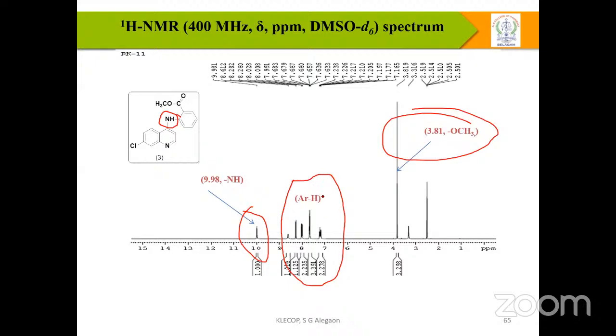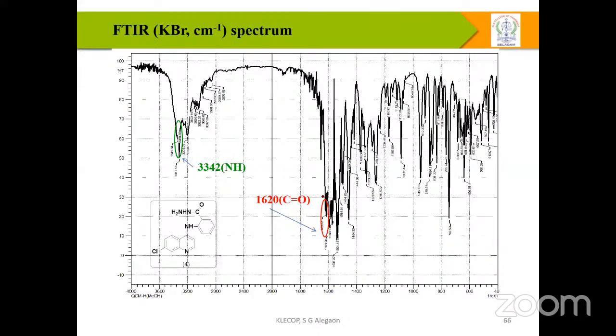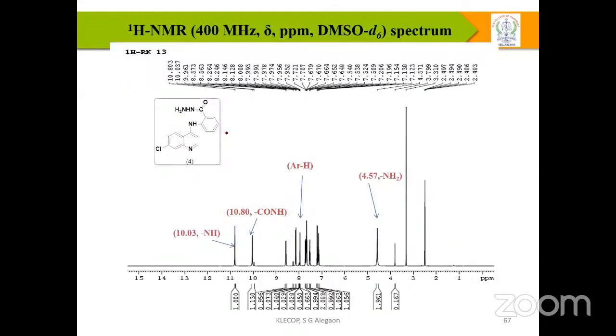And this we have further taken to hydrazide. In the hydrazide, most of the time the IR spectrum can give the same spectrum as we observed in the previous one, because we are taking the normal condition of the spectrum. We did this with the hydrazide and sent it to NMR.